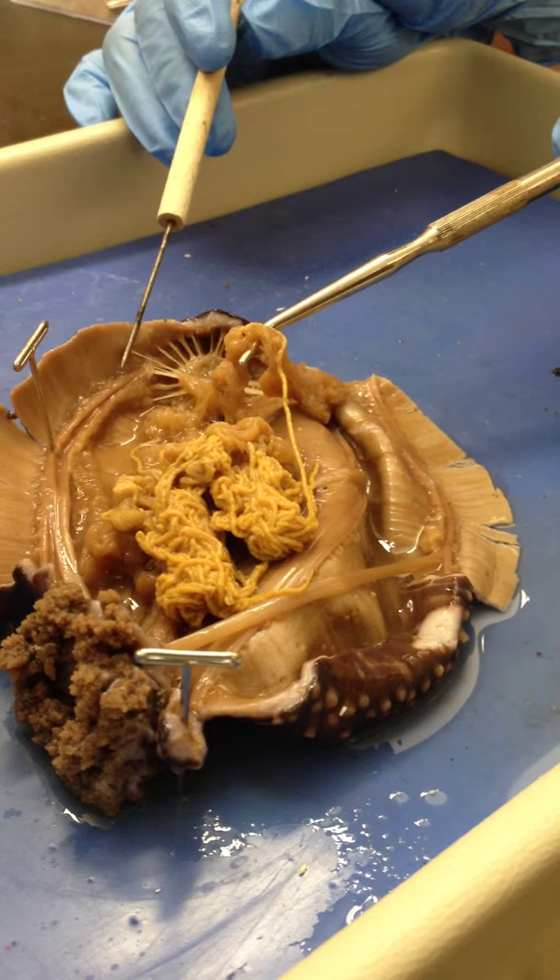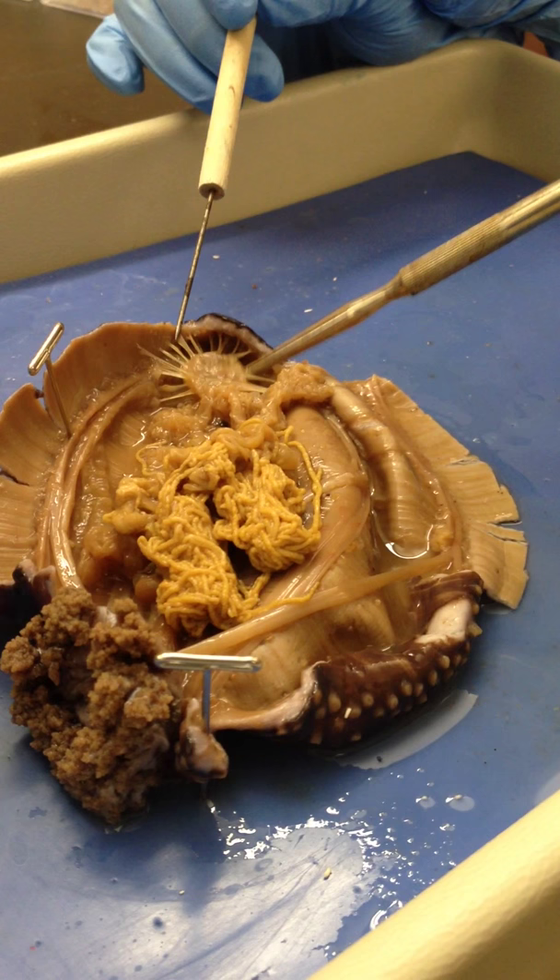This thing here — respiration tree. Respiration tree. This right here is the cloaca. The pulsing blob thingy.